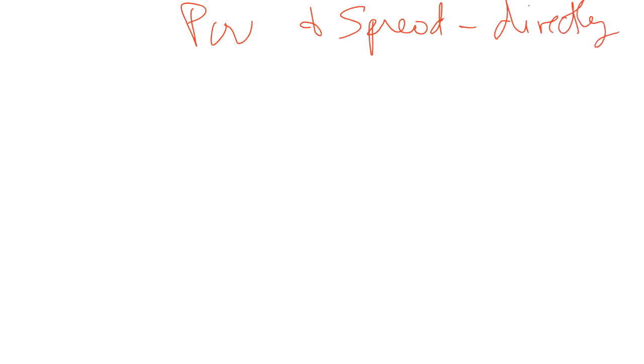All right, so let's talk about these. Remember that we said pour plates and spread plates allow us to count bacteria directly. And it is direct because we're actually counting the bacteria. Not only that, but we're counting live bacteria, because only those live bacteria in the sample are going to give you live colonies. Now remember the pour plate is working with hot or warm agar, and that could kill some cells if the cells are sensitive. Nonetheless, you're working with live bacteria, and it's a direct method.